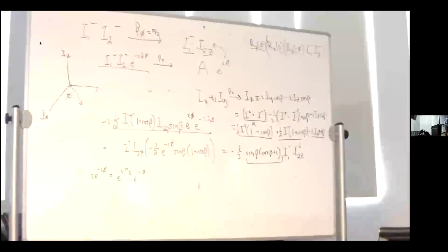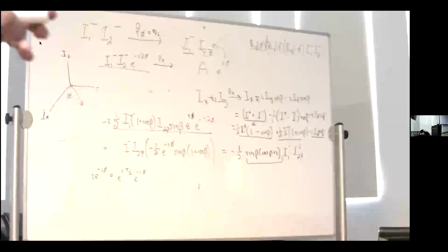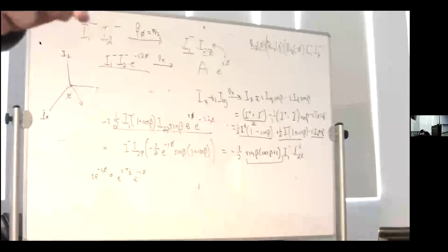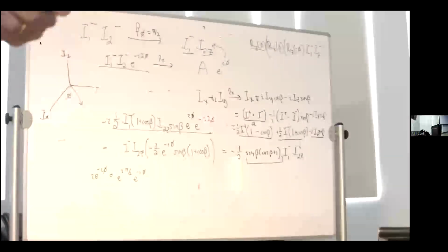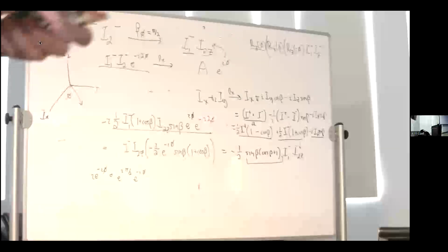And that actually was one of my more cited papers as a postdoc, that in a methyl group, when you're doing NMR sequences, you get lots of terms because of all of the proton-carbon interactions.